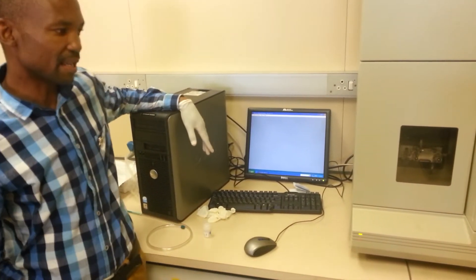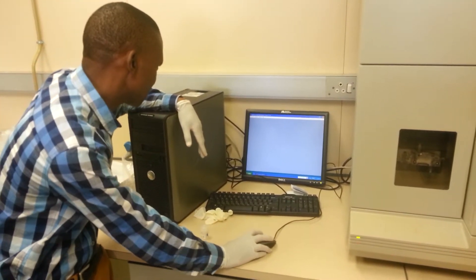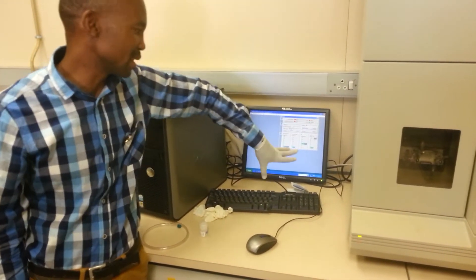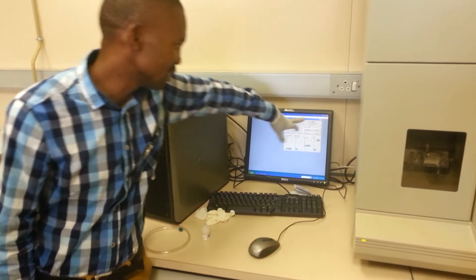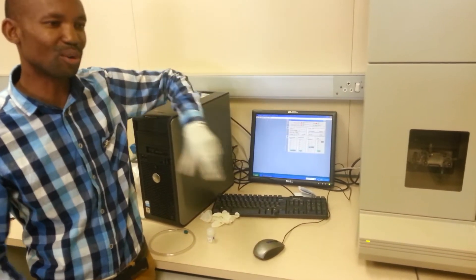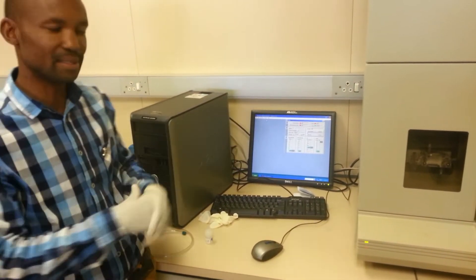Another way to check if the PC is picking up the instrument, you can just come to this window and say 'status.' It will show you that the instrument state is on idle. Electrophoresis is off, of course — nothing is happening. The laser is off, and the doors are closed. So this is basically the window where you can also verify that it's fine — there's communication between the instrument and the computer.